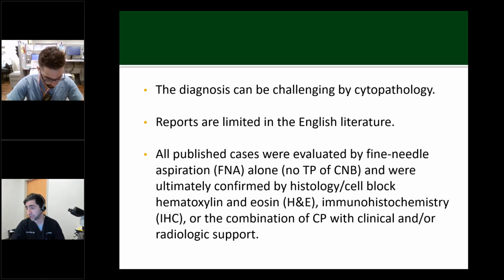However, the diagnosis of renal angiomyolipoma by cytopathology remains a little bit challenging, with limited reports in the English literature. It is worth noting that previously published cases were primarily evaluated by FNA only, without the incorporation of touch preparations of core needle biopsies.